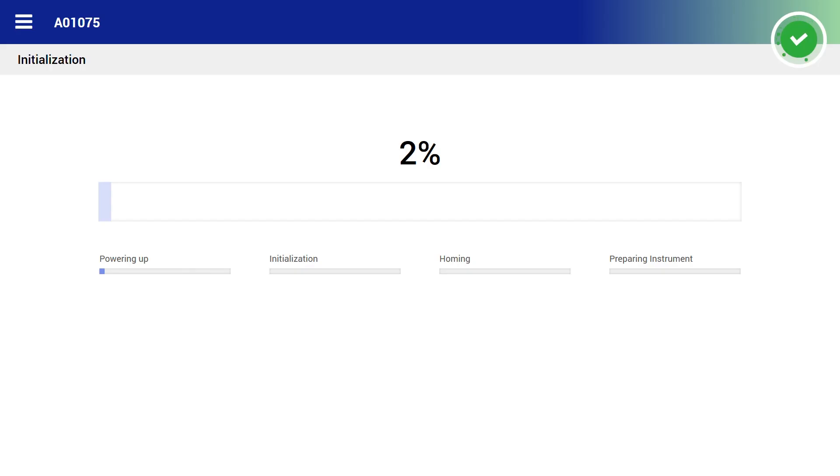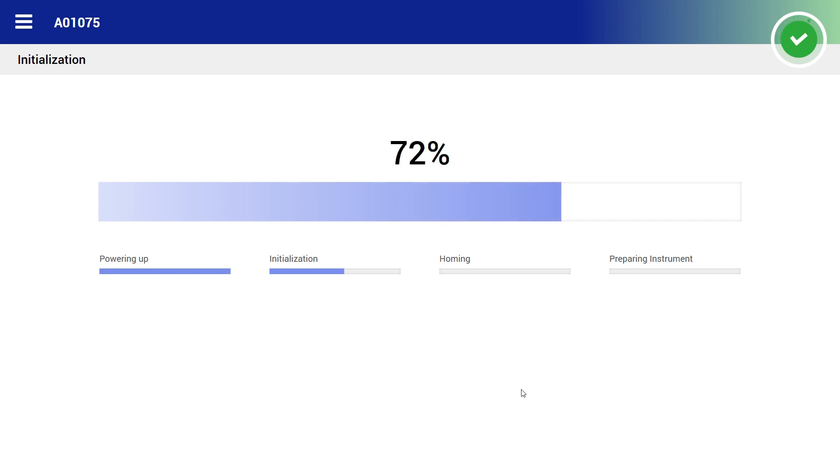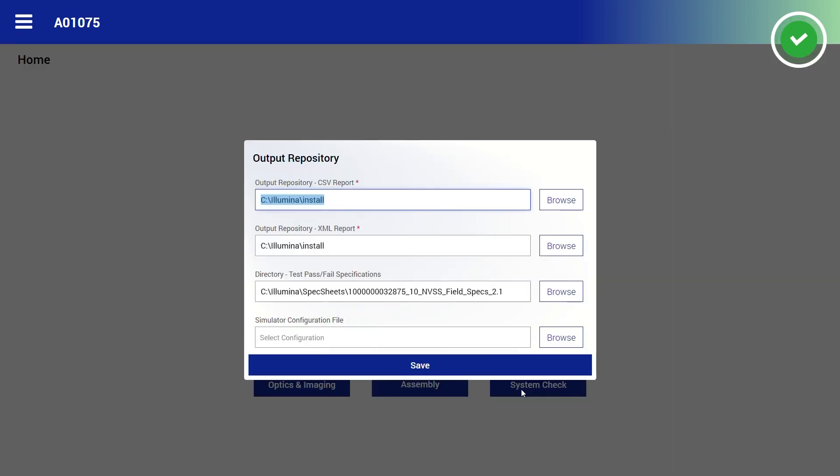To perform the system check, open NovaSeq service software. The service software will take several minutes to initialize. Once the service software is initialized, the instrument will give you the option to select an output location for the test results. Leave the default settings and click Save.